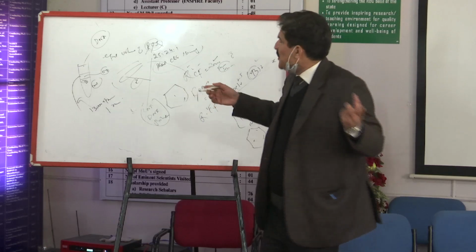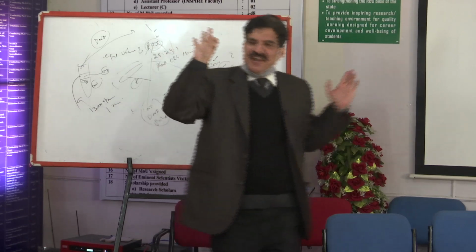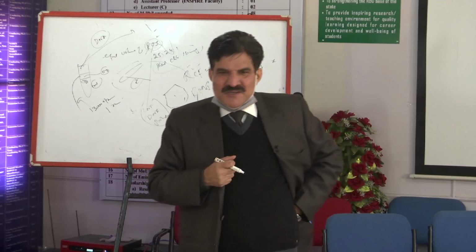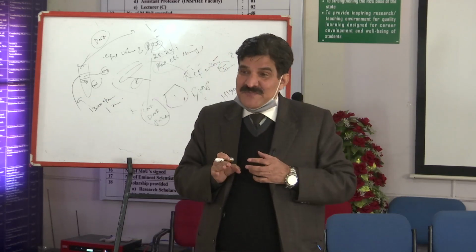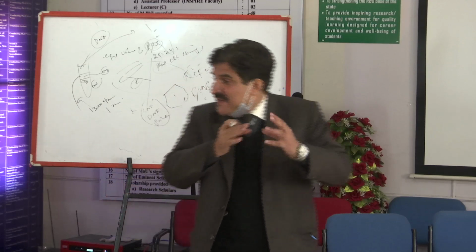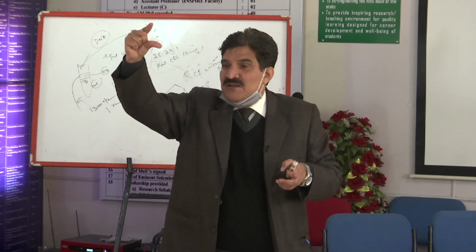You can take this aqueous phase once again and add PCI again. Only CI now, no need of P. Sometimes PCI is better. Again you can shake it for half an hour, then centrifuge. You can get three layers out. Are you getting my point? So again you will achieve phases.